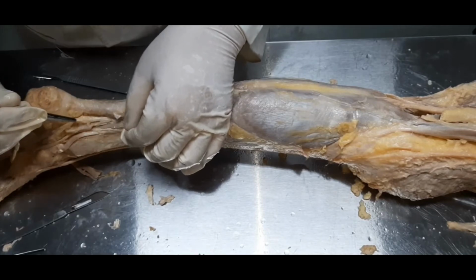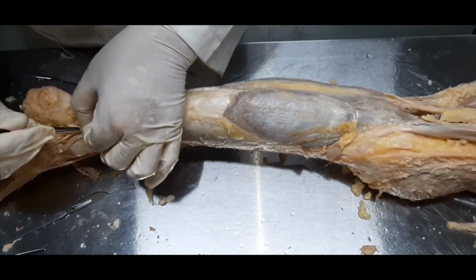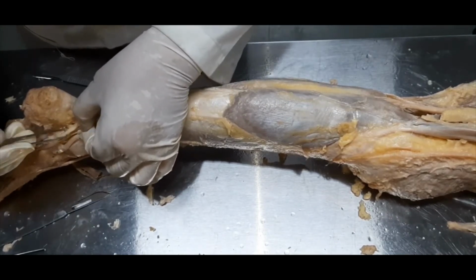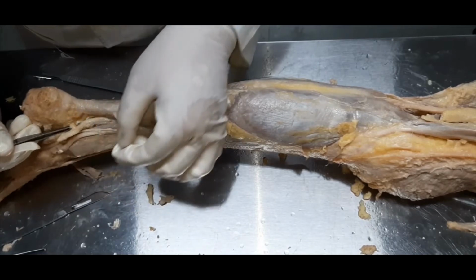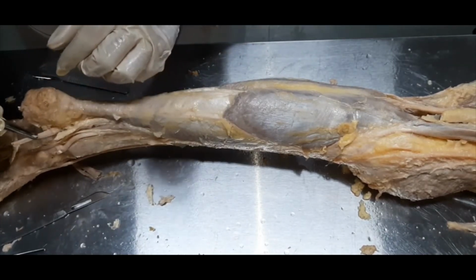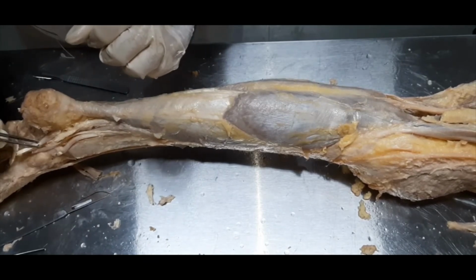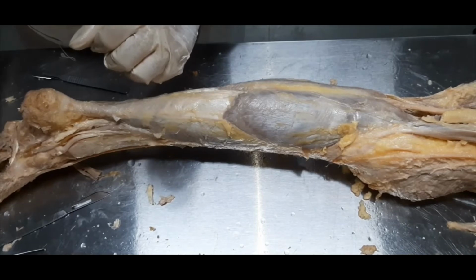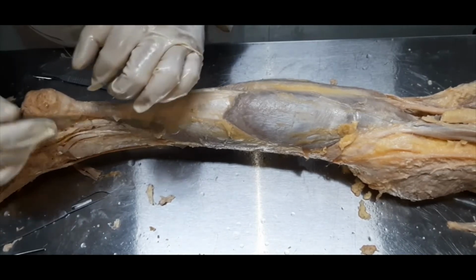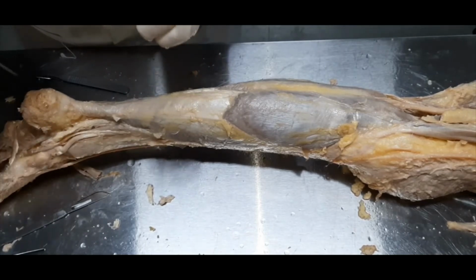Just posterior to this is the posterior tibial nerve, which is dividing into two branches, the medial and the lateral plantar nerve. You can see the lateral plantar, and deep to all these structures we get this tendon, the tendon of the flexor hallucis longus. This tendon was also cut during the dissection of the sole. So we have seen all the structures which lie deep to the flexor retinaculum.